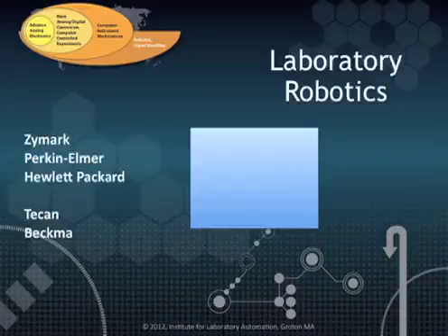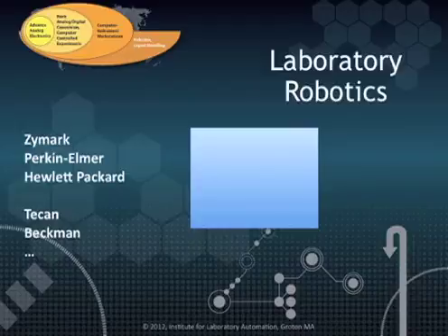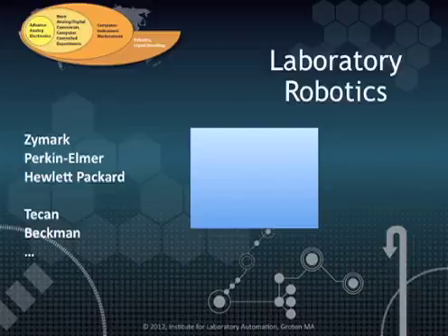Of the sciences, life science industries have the most sophisticated approach to robotics and liquid handling systems. The commercial work in laboratory robotics began with companies such as Zymark, PerkinElmer, and Hewlett-Packard. In each case, the approach was the same: provide components and let the user design and build the robotic system. That didn't work very well, and many attempted projects found themselves abandoned. The robot systems that were developed were based on two styles.